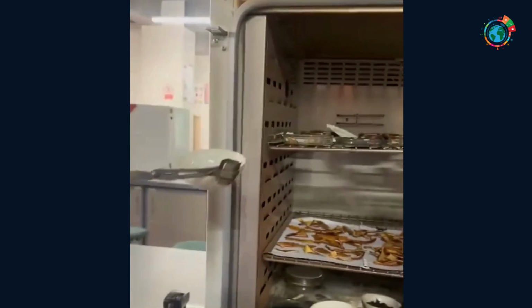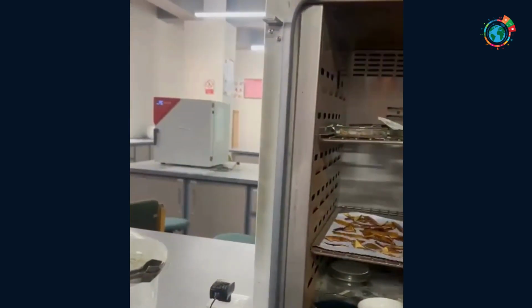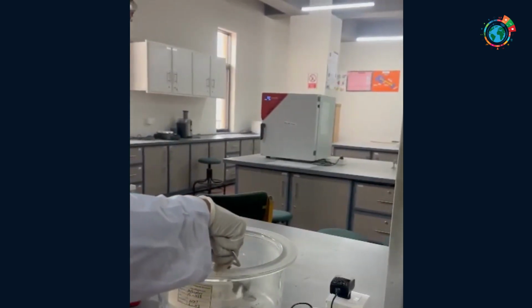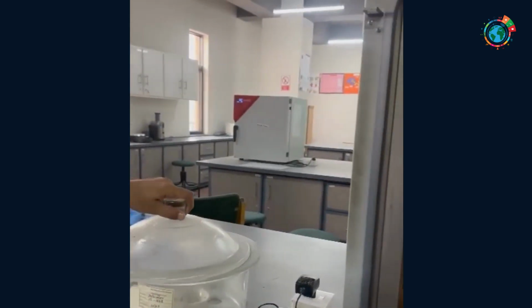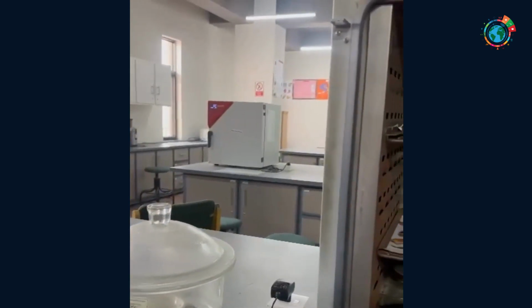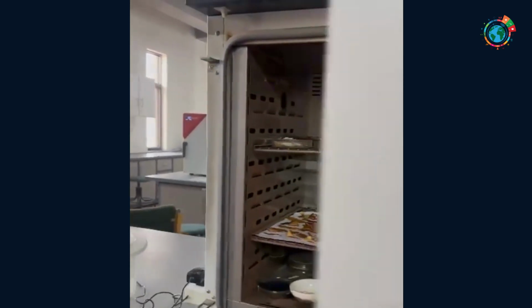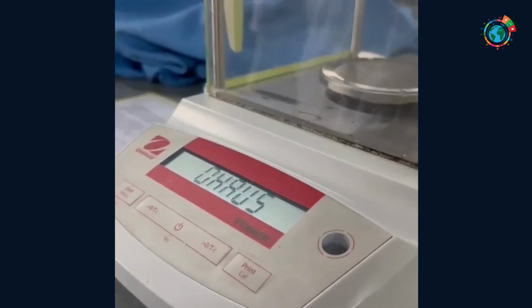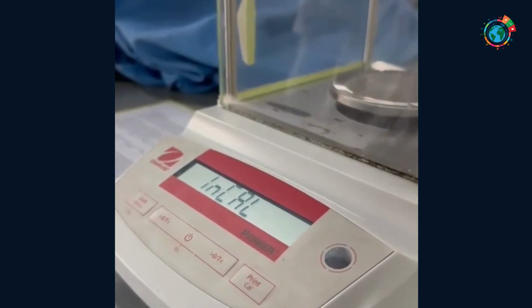Using a desiccator after preheating a china dish for 30 minutes serves the purpose of allowing the dish to cool down to room temperature gradually. This controlled cooling process within the desiccator helps prevent any moisture from recondensing on the surface of the dish. After 30 minutes of cooling in the desiccator, the empty china dish is now ready to be weighed.